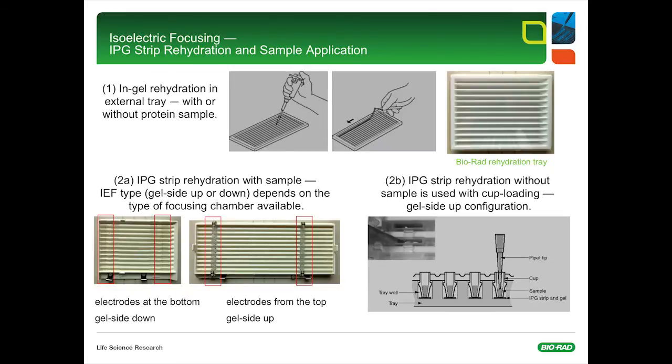In principle, IPG strip rehydration is very easy. Simply pipette the rehydration solution with or without sample along the center of the channels of the rehydration tray. Next, remove the cover sheet from the IPG strip with forceps, and then gently place the IPG strip gel side down onto the solution in the channel. Please take care not to trap any air bubbles beneath the IPG strip.